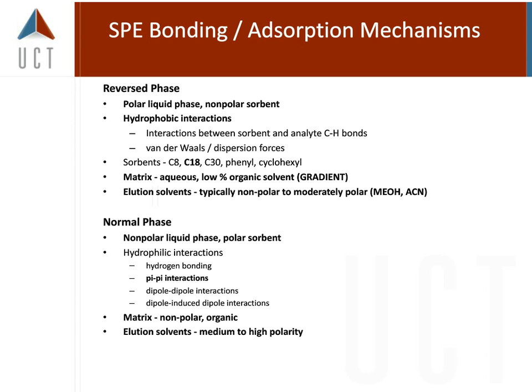Again, lastly, in getting to the end, when we're looking at solid phase extraction, we talk about reverse phase, we talk about ion exchange. The same terms are used when we're doing LC chromatography. Reverse phase columns, normal phase chromatography. If we have a gradient in LC, it's because we're starting at a lower organic.